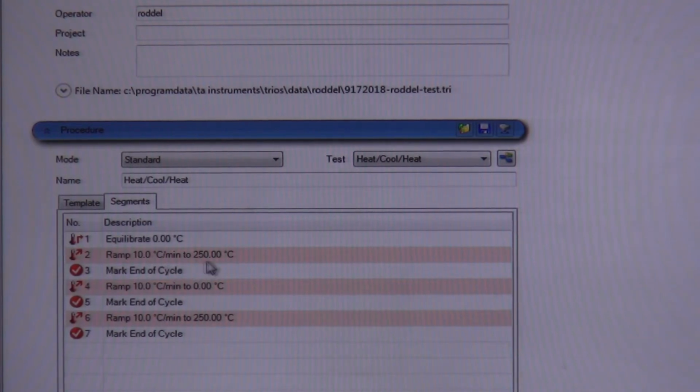So in this case, you have these 3 steps: heat, cool, heat. Like I said, in this case, you are controlling your cooling step. So be mindful of the heating or cooling rates that you're doing in order to control whatever may be happening to your sample as it cools down, whether that be crystallization or vitrification, turning into a glass, etc.